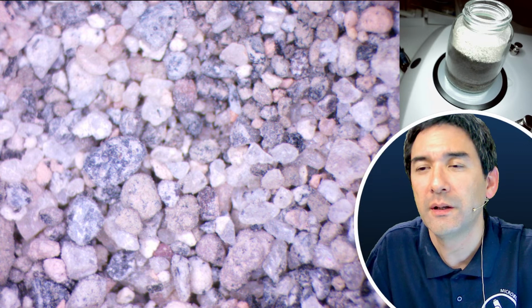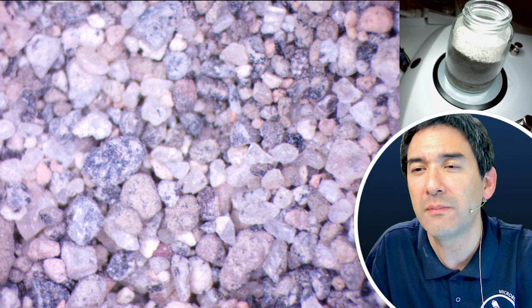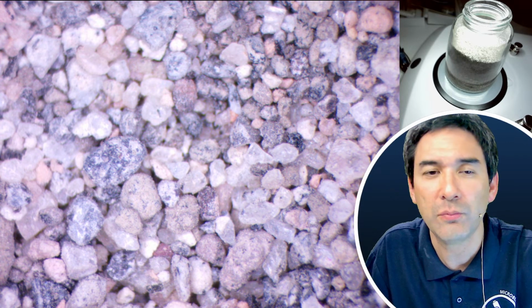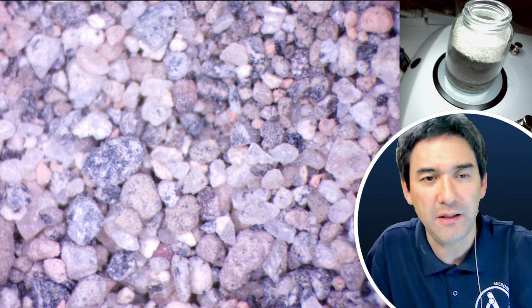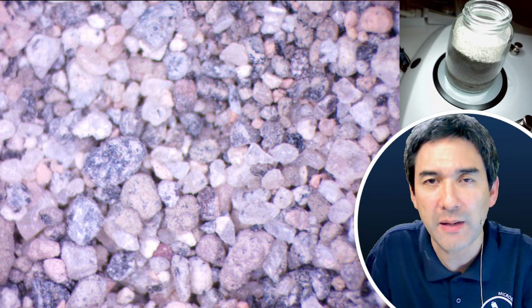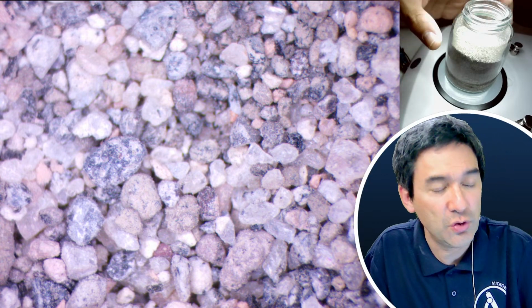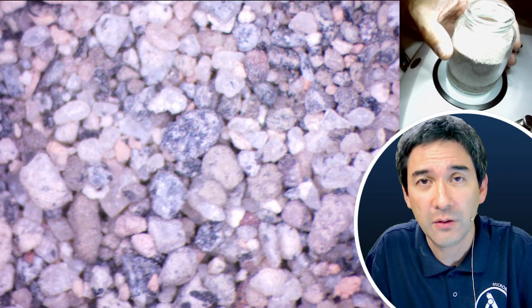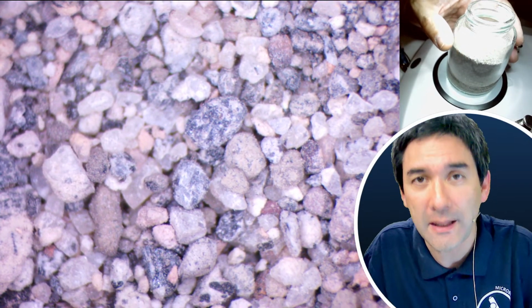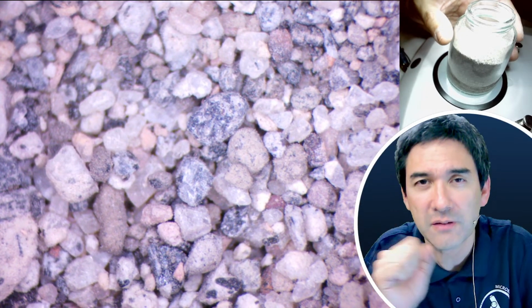So I've been told that meteorite grains can be found sometimes in the gutters of building roofs. You're talking about so-called micrometeorites. Yes, and I too have been experimenting with those micrometeorites. There are lots of resources available online, and you can look for micrometeorites using a magnet, because many of them are tiny spherical particles made of iron.